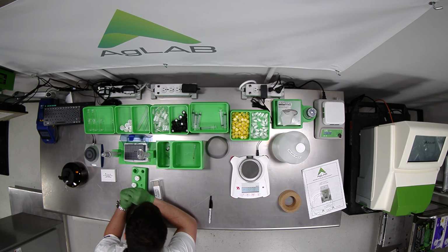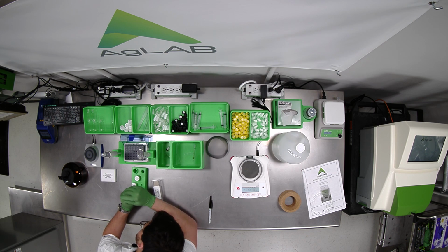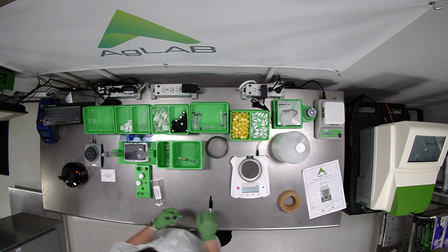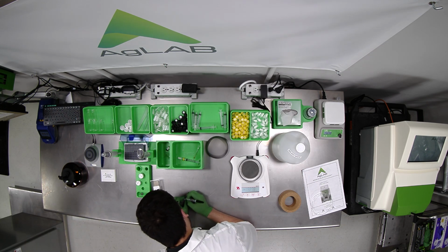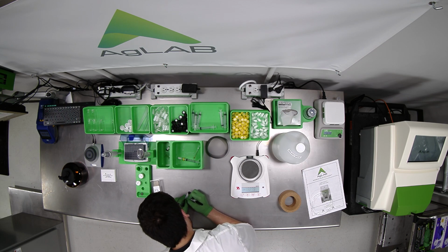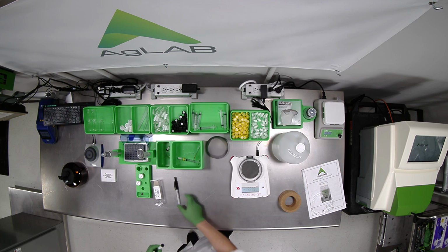All right, you want to line up the spout of the quick catcher perfectly in the center of this vial so that it's not touching any of the glass, and it just drips perfectly down into the bottom. Okay, and that's it. We have our final sample. Just for logging purposes, I'll write down the sample. Stage 1, distillate 1, final sample, and that original weight that we took was 0.053 grams. Okay, sort of legible.